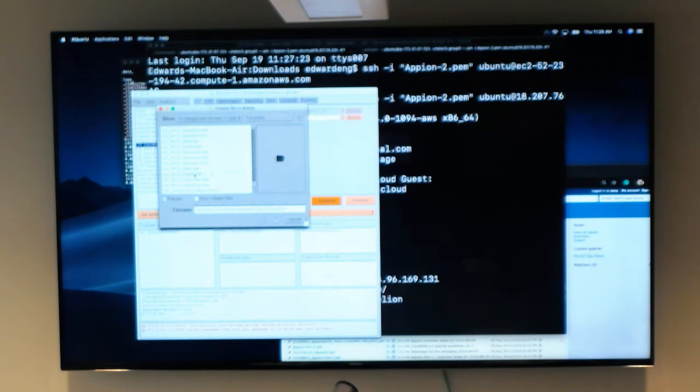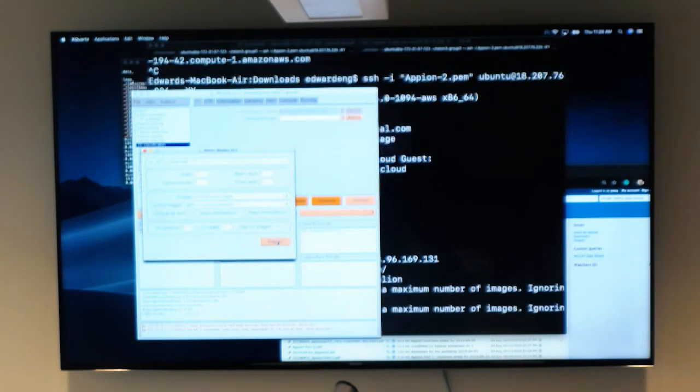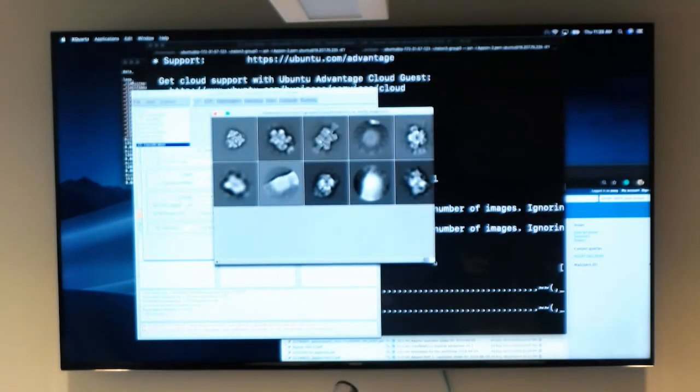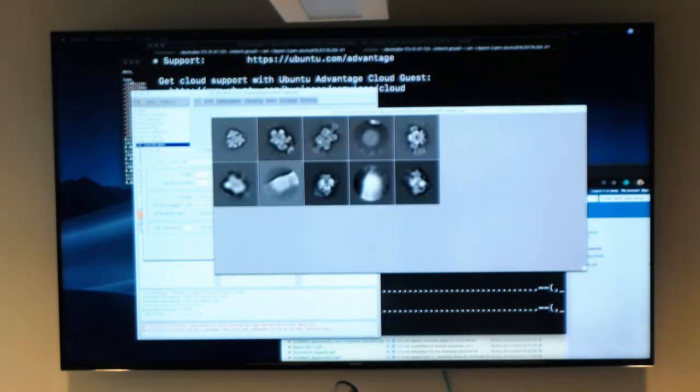So I only did 20 iterations, but if I want to display the model halfway, model.star, I can see the current status. It's over here. It takes a while for my X to swipe. Here we go. I only did a few.